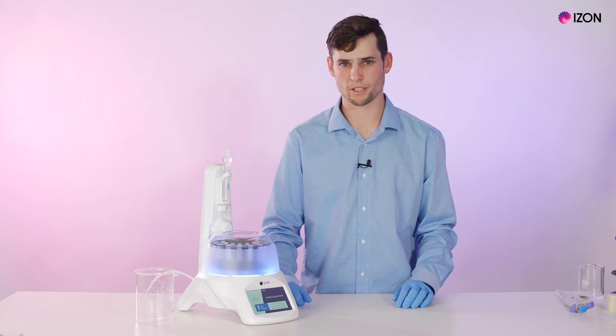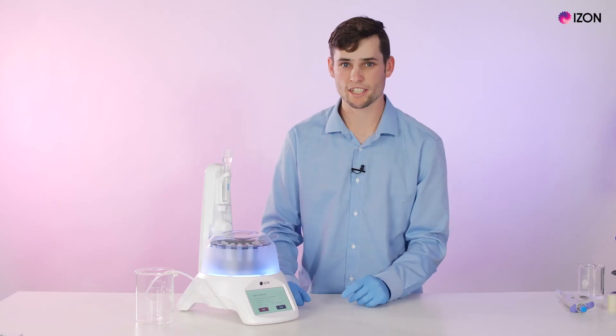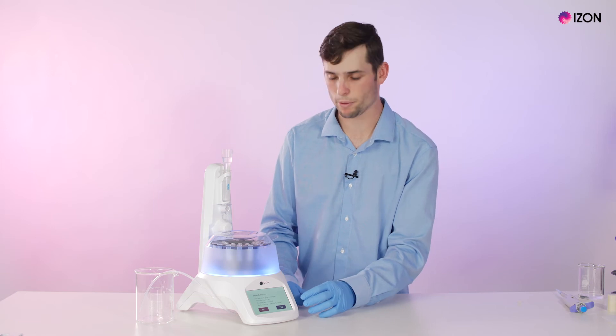To start the run we can press start collection. This will then take us through a series of screens to confirm that we're collecting the correct schedule.